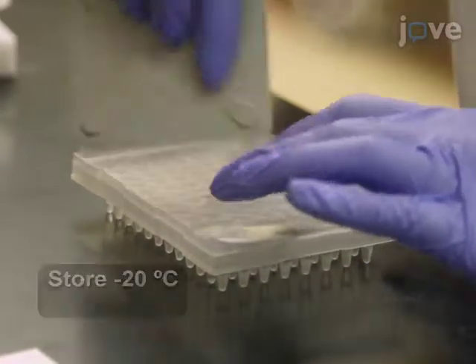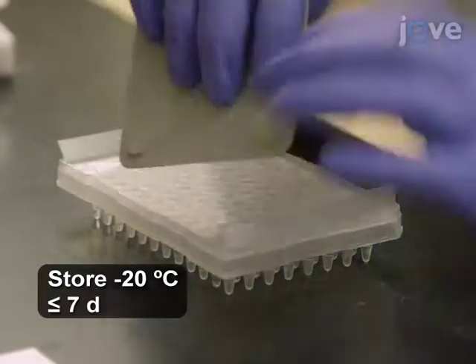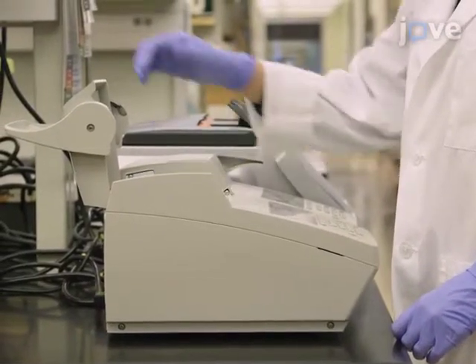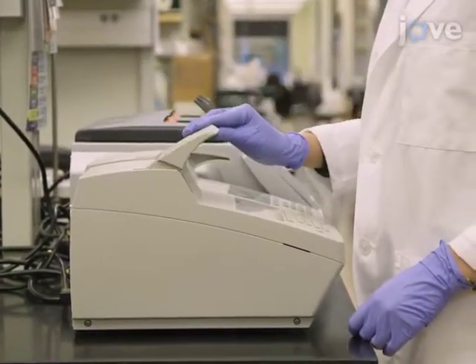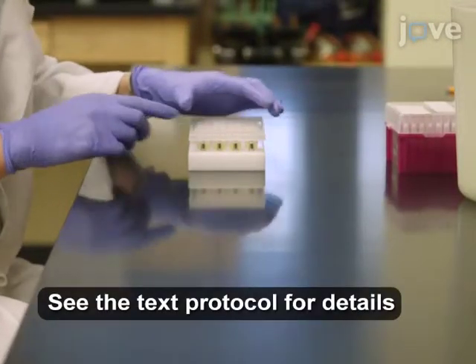Cover the plate with a clear adhesive and store it at -20 degrees Celsius for up to 1 week. Use the collected supernatant to perform an index PCR to attach barcodes to the adapter sequence. Then purify the products and prepare the indexed library for sequencing.